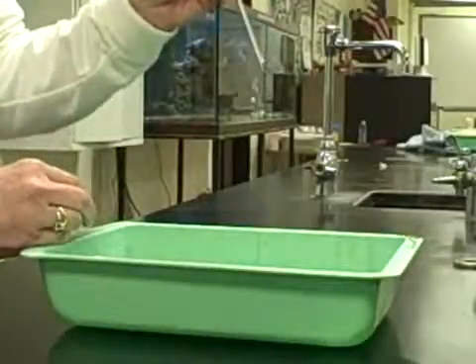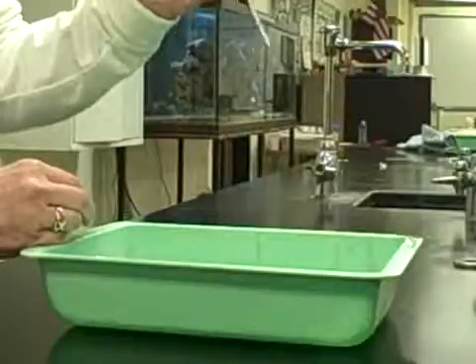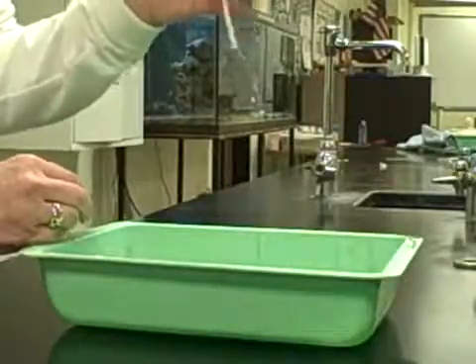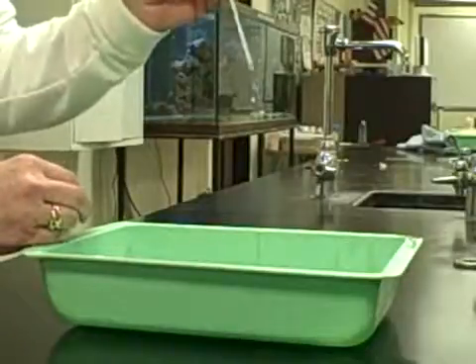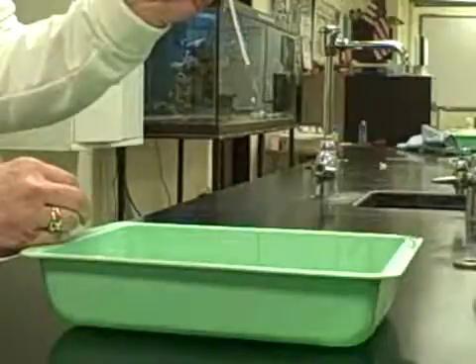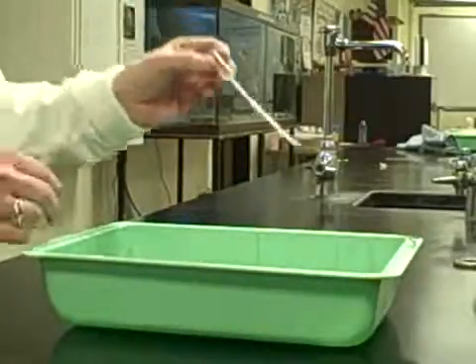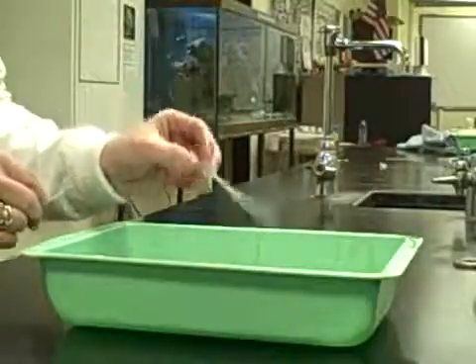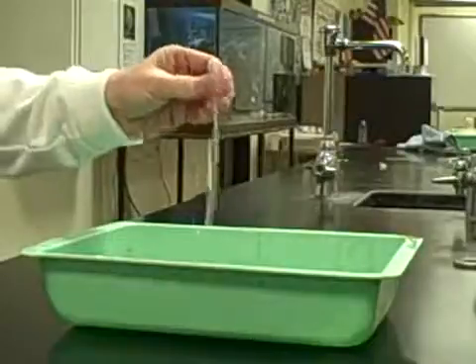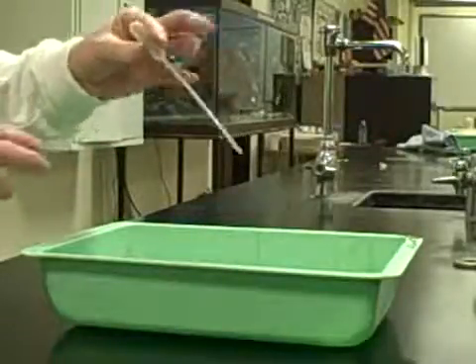Then you're just going to start dropping it in, 1 drop at a time. 1, 2, 3, 4, and you're going to do this until you've squeezed every drop out of there. You want to try and keep each drop the same size, so have the same person doing it. It'll take you a little while. Again, like I said, this is probably the most difficult part and definitely the most cumbersome, most meticulous part of the lab. But you need to find out how big this pipette is when it's filled with room temperature air.